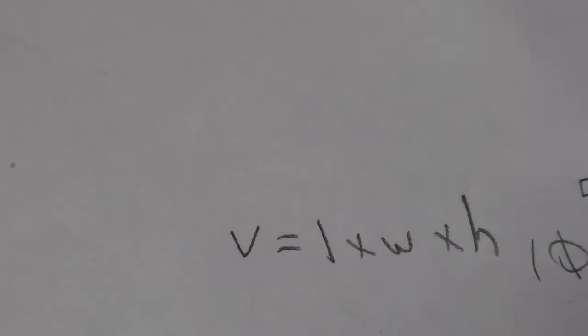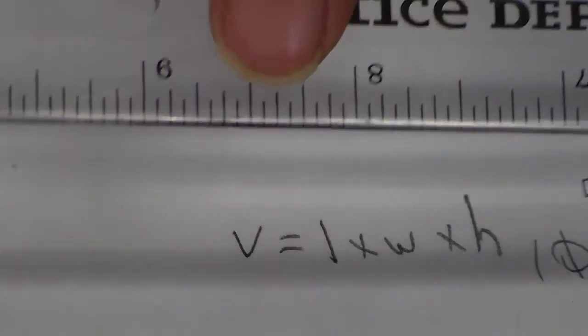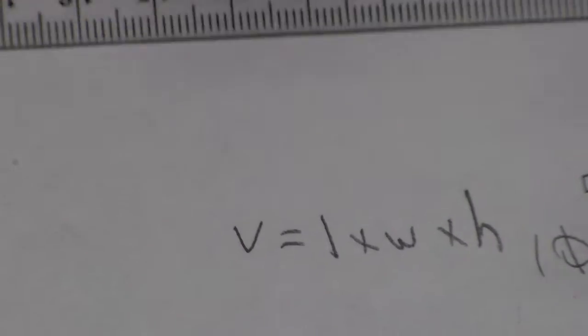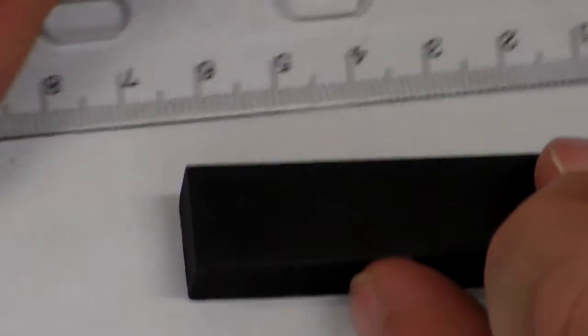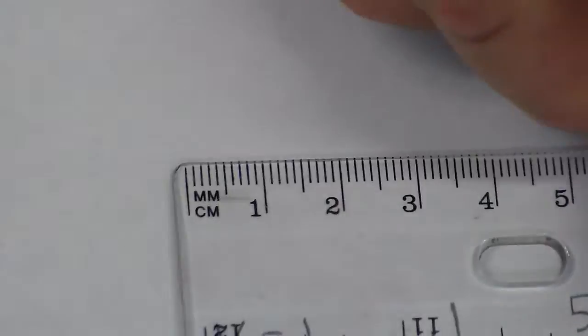Are we going ahead and using this side here? Nope, that's our inches. We don't use that. But we can use this side, our metric. So we'll go ahead and measure it another way. Actually, let's just do it the way I have been doing it, like this.